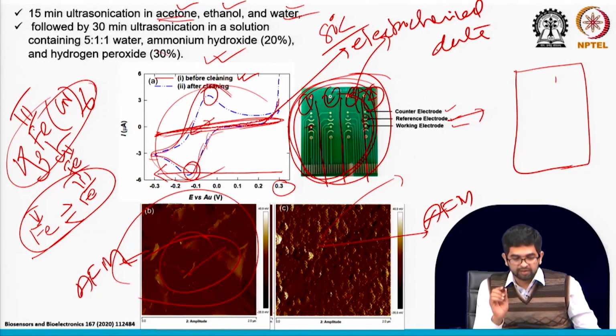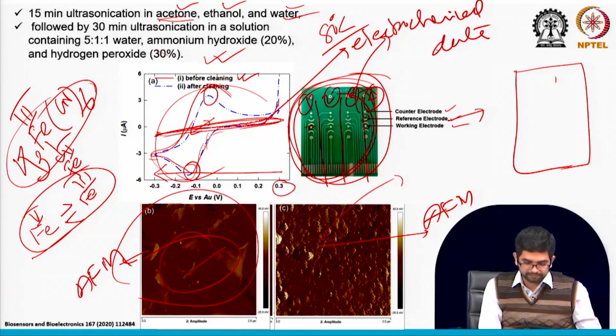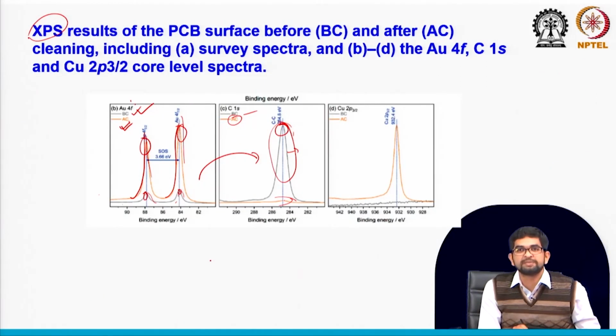So, whenever you want to develop a biosensor, characterize the surface very systematically. First go for the electrochemical measurement, then AFM measurement, then XPS measurement, and you see the contamination.